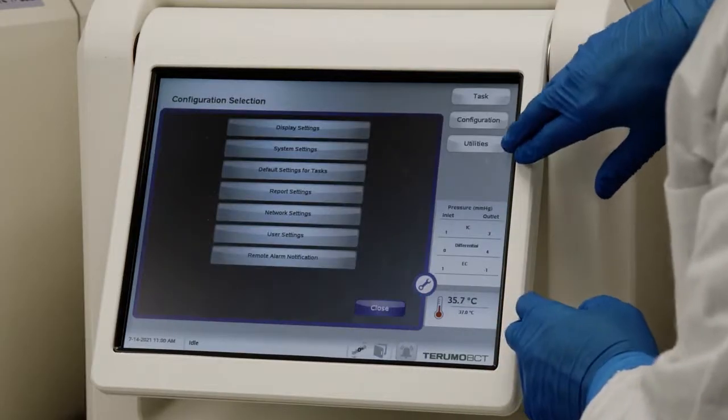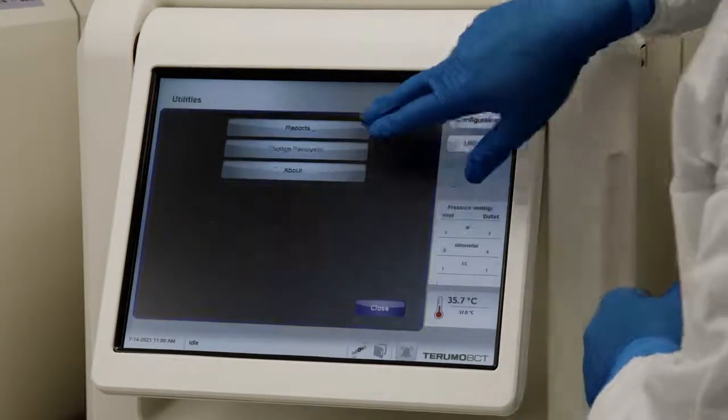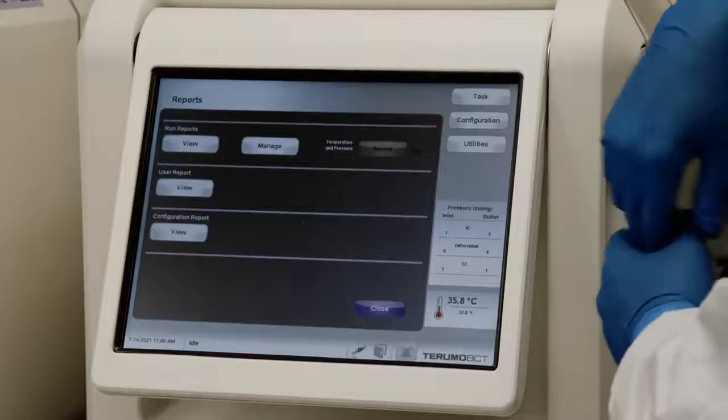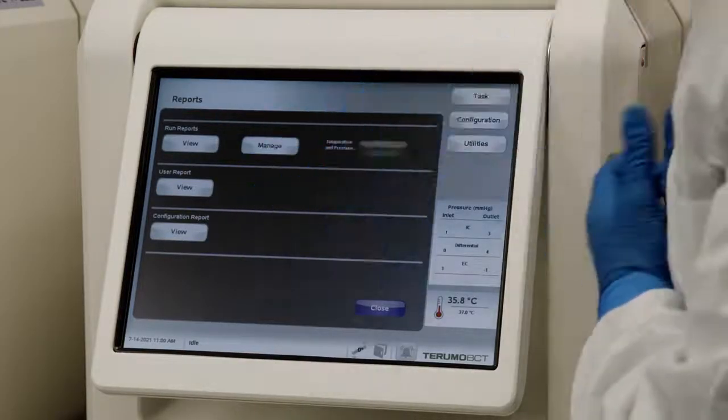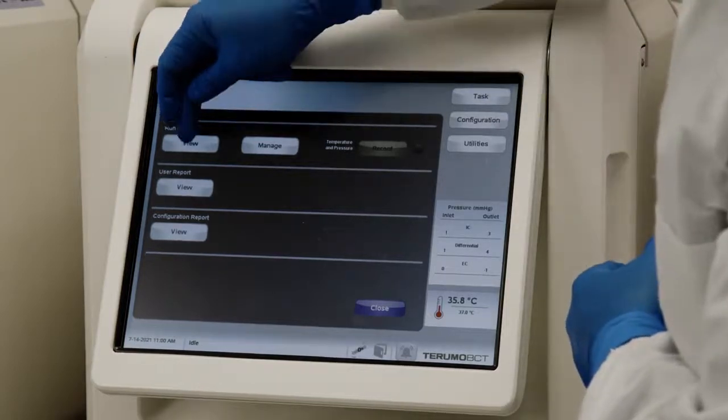Reports can be viewed in the utilities tab. And there are three different report types: there's a run report, a user report, and a configuration report. Let's view the current run report.